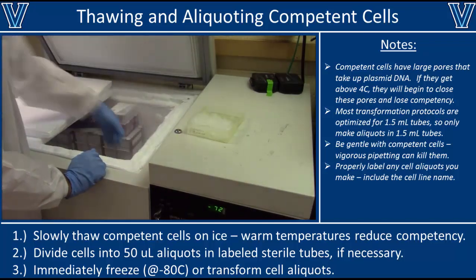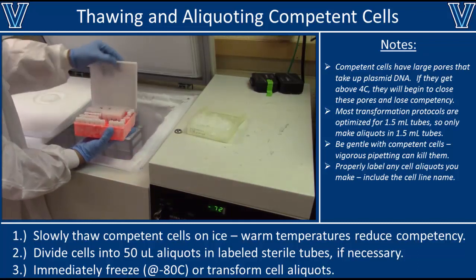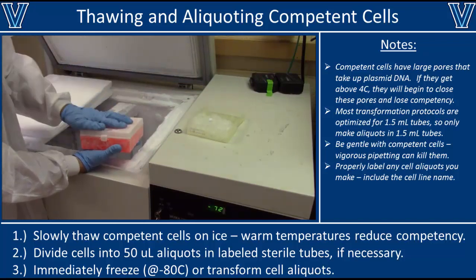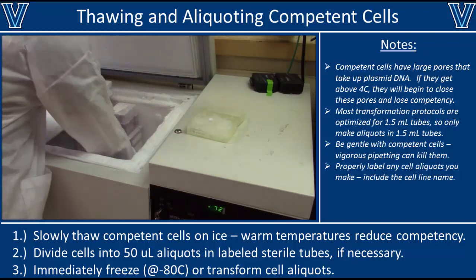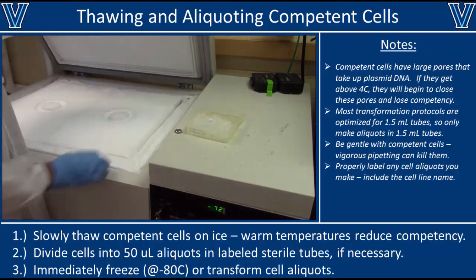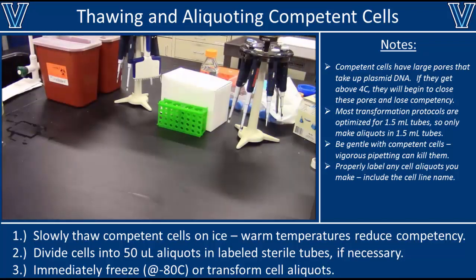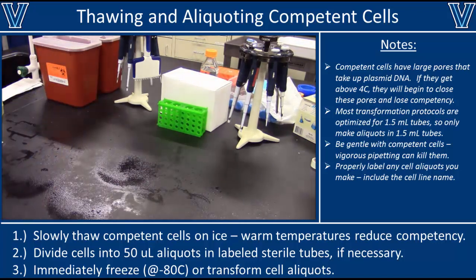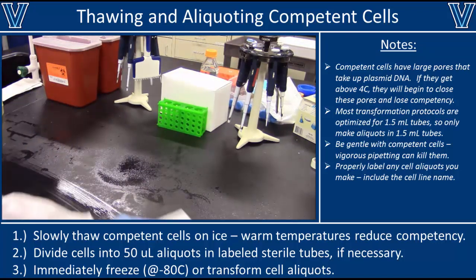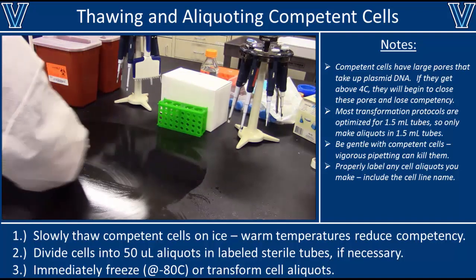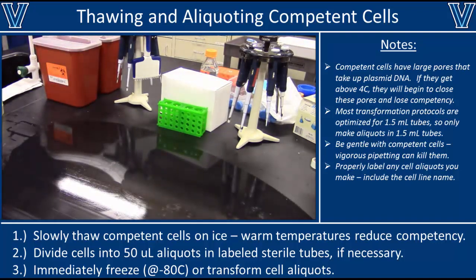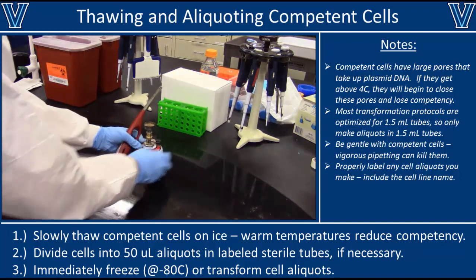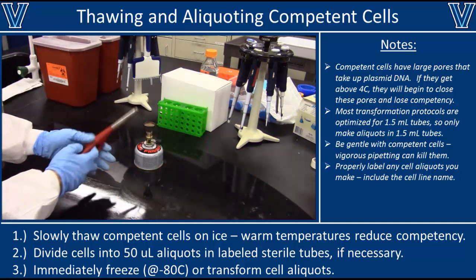Once your plates are ready, you can start thawing out your competent cells. Competent cells are kept in the -72 or -80 degrees C freezer to maintain their competent state. If they're allowed to thaw at room temperature, the pores in their membranes will seal back up, so it is very important to thaw the cells on ice to prevent the pores from closing. While your competent cells are thawing, sterilize the bench with 70 or 75 percent ethanol, and also sterilize your gloves with ethanol.